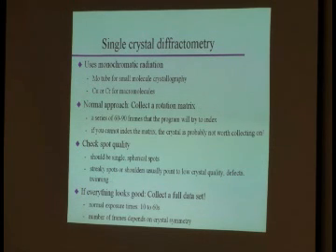You have two starting materials, you want to get a product. You know the crystal structure of the starting materials. Guess what? It might be worth quickly checking, when you get an index on your matrix, whether that happens to be one of your starting materials. Okay? You can do a quick database search. Is this a known cell, and is the composition something that could be in my sample? In that case, it's not worth collecting.